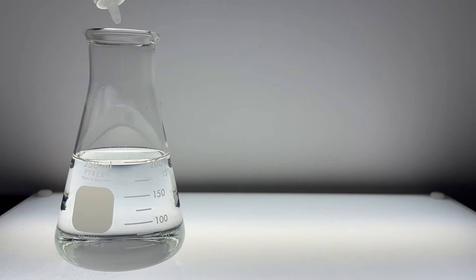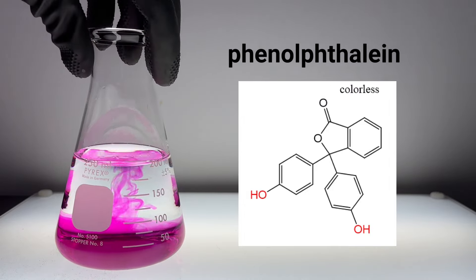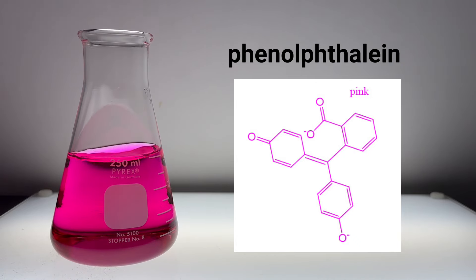This solution contains another acid-base indicator called phenolphthalein. Phenolphthalein undergoes the same type of chemical transformation as thymolphthalein. However, phenolphthalein turns a magenta color in the presence of base. But check this out.